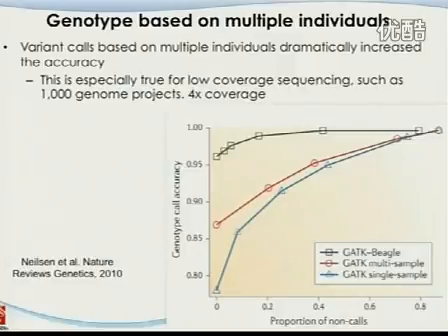Once they integrate the population, because we know the population of these 1,000 genome samples, you can see the accuracy is really improved dramatically. So it's fair to say that although the coverage in the 1,000 Genome Project is pretty low, given the depth of analysis we have, the conclusion from the 1,000 Genome sequencing is very credible at this stage.